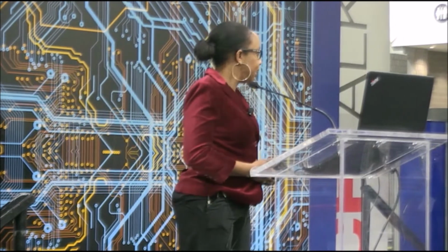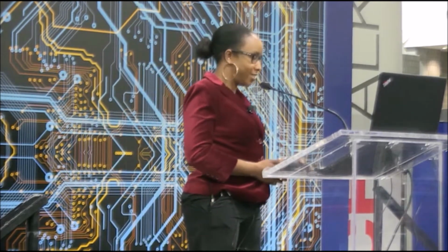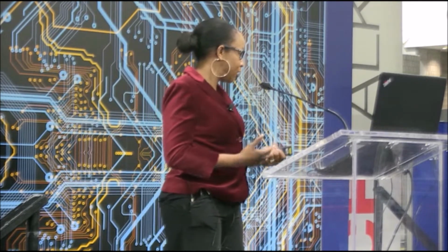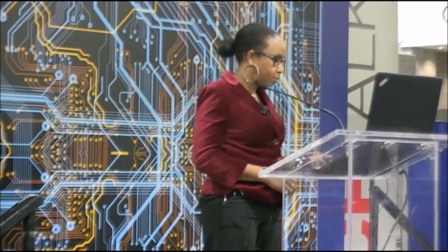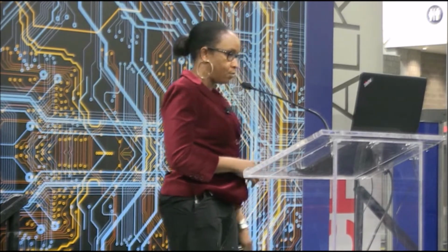Now, I'll mention here that we use the 9 logs, of course. If you are a poultry facility and you have 9 logs of an organism, you have a big problem, right? You have to address or answer some serious questions. But in the world of research, we inoculate at these high levels so that we can very clearly see inhibition. That is why those counts are so high. It was this cell suspension that was used to inoculate both the broth study and the study where the poultry product was used.